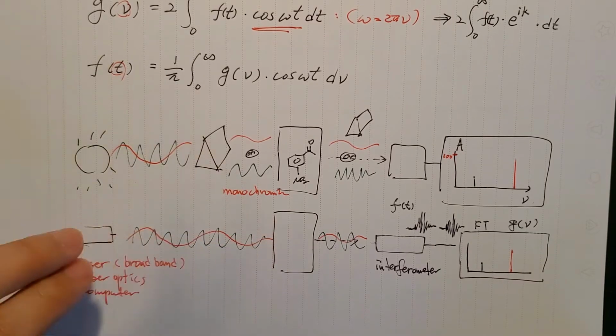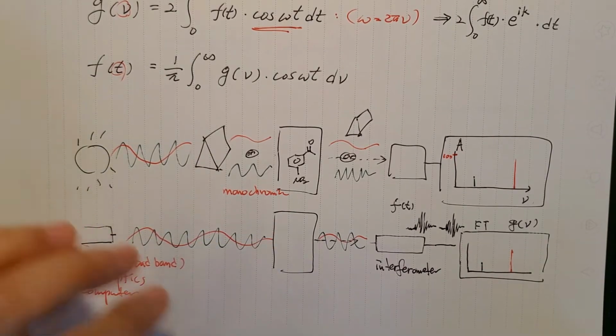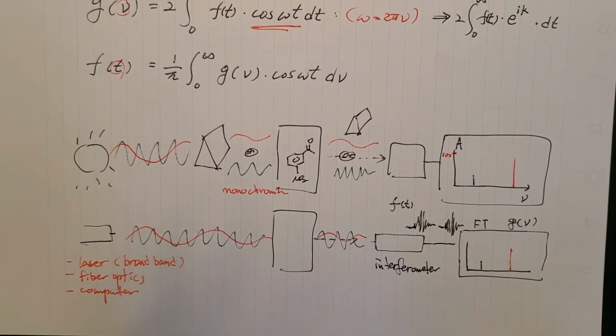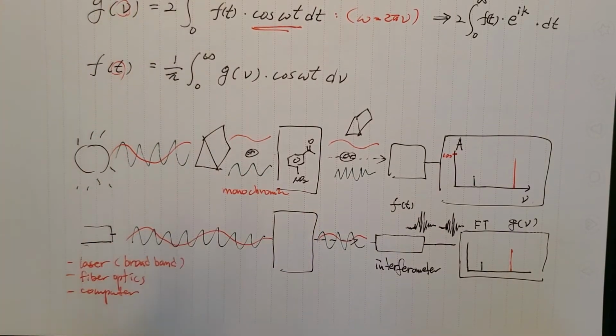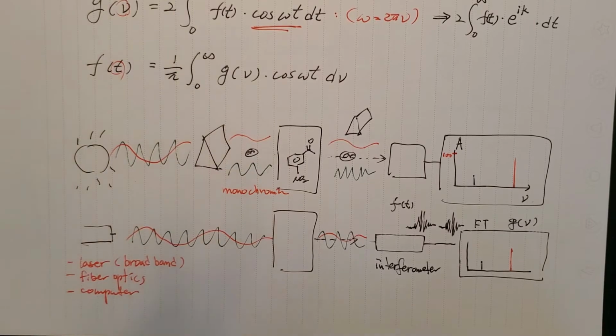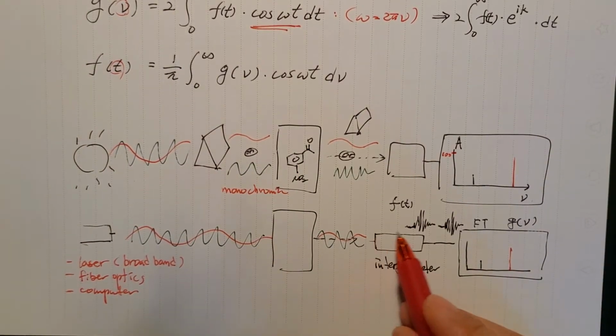So all of these lights hit the molecule and resonate with the frequencies existing in the molecule, and then change the photons coming out, and then go through the interferometer, generating this interferogram.